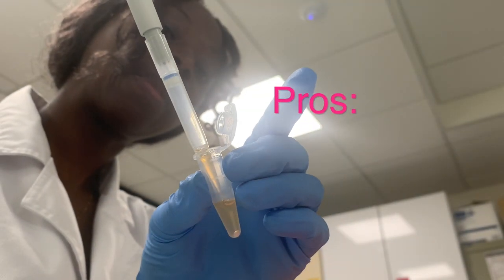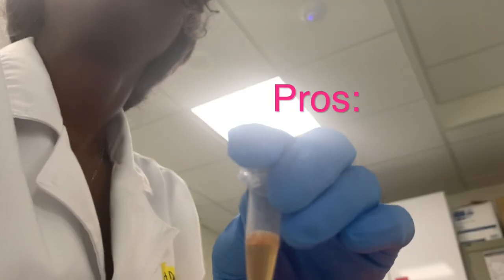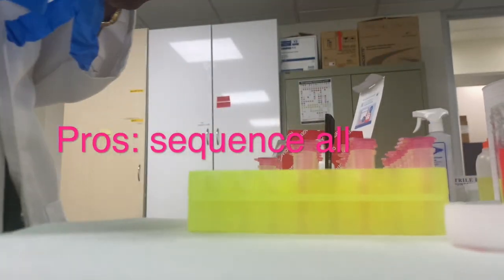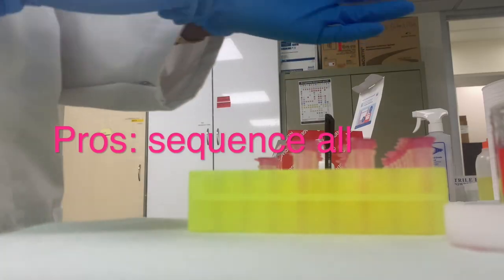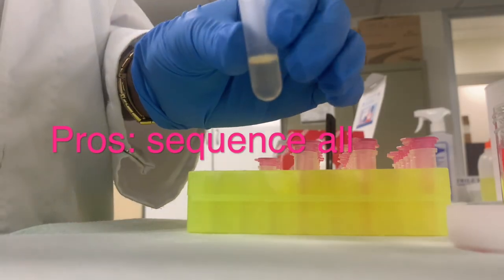The RNA sequencing platforms have superior sensitivity and a large dynamic range, which means that it's able to detect very small quantities of transcripts, but also very large quantities of transcripts. And what makes this technique desirable is that you're not limited to known sequences. The reason, of course, is that you're not working with probes that are complementary to your genes of interest, but you're simply sequencing all transcripts that are present in your sample.